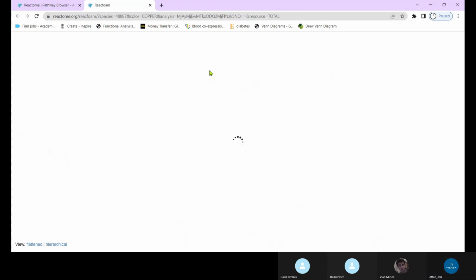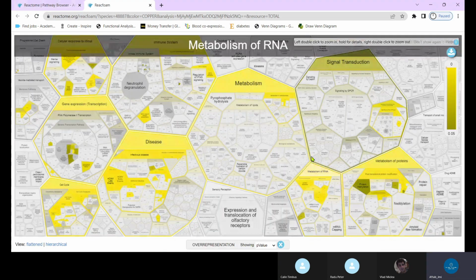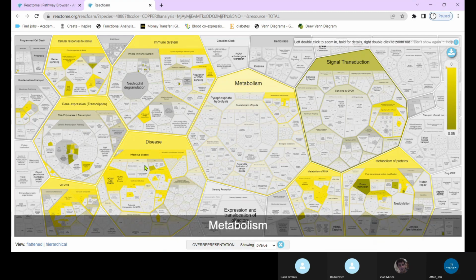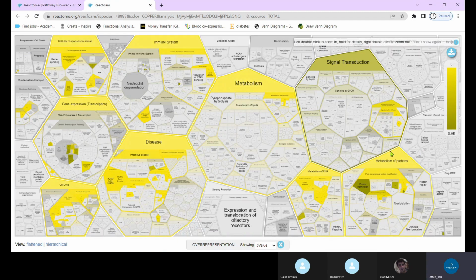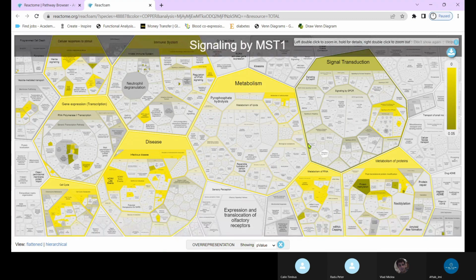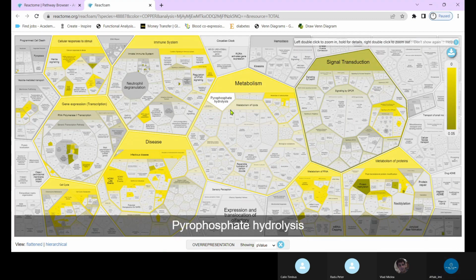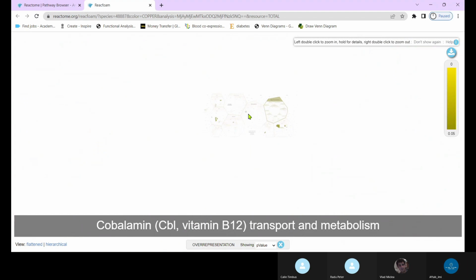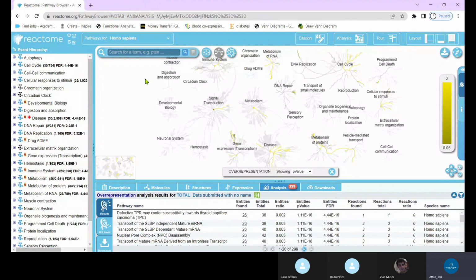I have shown the PPT like that. This is another method. Here most of the proteins are from the cell site. I just took a random list of proteins. This is one method, and another method is protein with a rank value for that set.